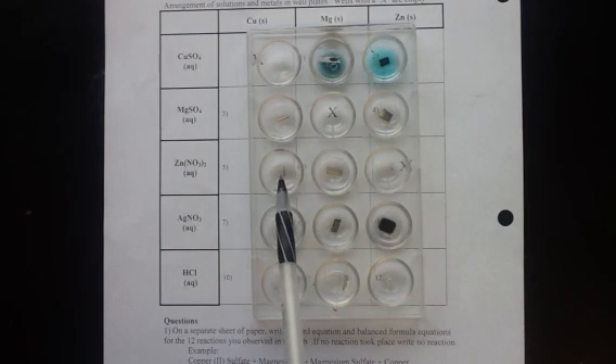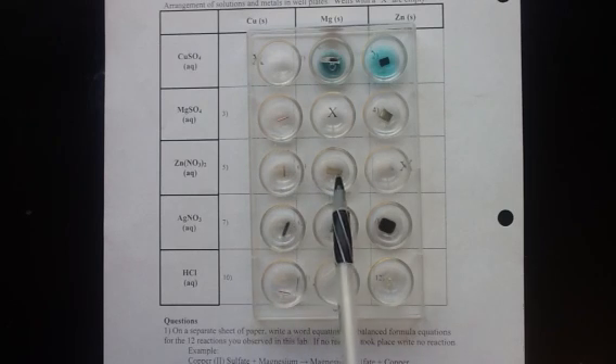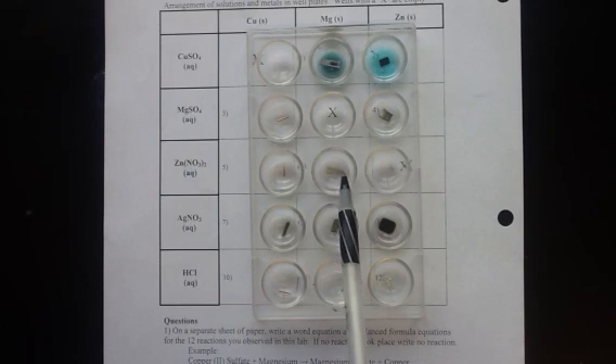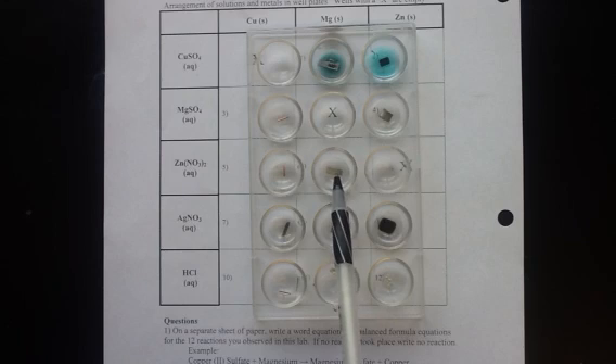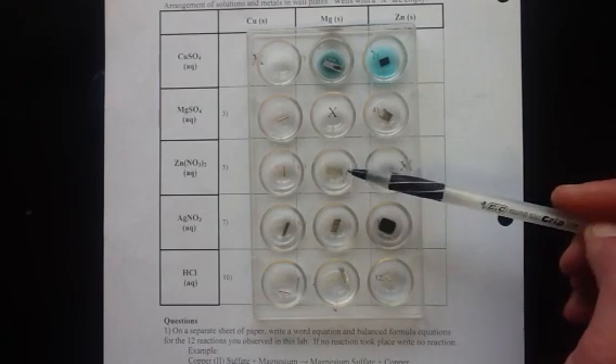Right here with the copper metal and the zinc nitrate solution we have no reaction taking place. In this box right here we do have a reaction - the zinc nitrate is slowly being replaced by the magnesium. You can see a little bit of black coating on the outside of the magnesium metal - that's zinc coming out of the solution.